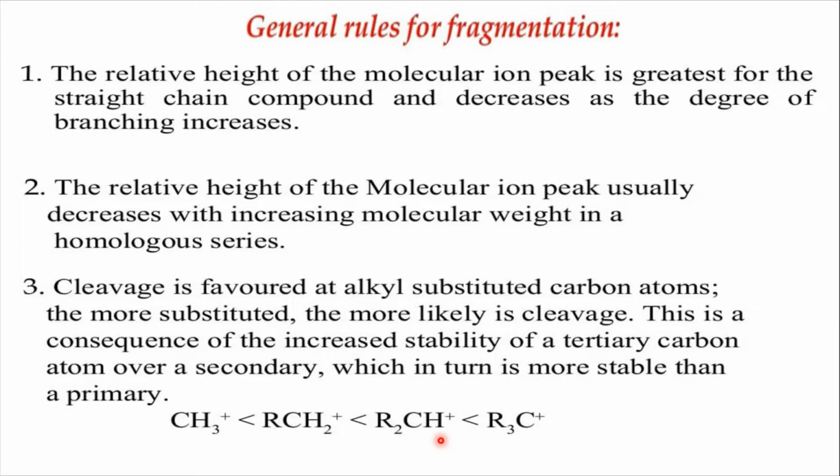If we consider the factors stabilizing carbocations, they may be the plus R effect, that is the resonance effect, or the plus I inductive effect. Resonance effect and inductive effect stabilize the carbocations. Here, as the number of alkyl groups increases, the stability of the carbocation also increases, because the positive charge is present on a carbon having more alkyl groups. So the tertiary carbocation is more stable as compared to methyl, primary or secondary carbocations.